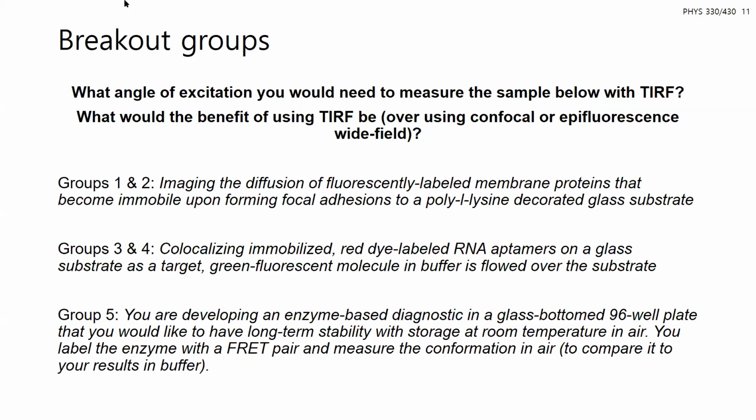And what about the other group? So we did it a little bit differently. We assumed an aqueous medium instead of the polylysine. So we used indices of refraction for water and the glass. Our glass index of refraction was closer to 1.5, and the water was 1.33. And so we got an angle of about 62 degrees.